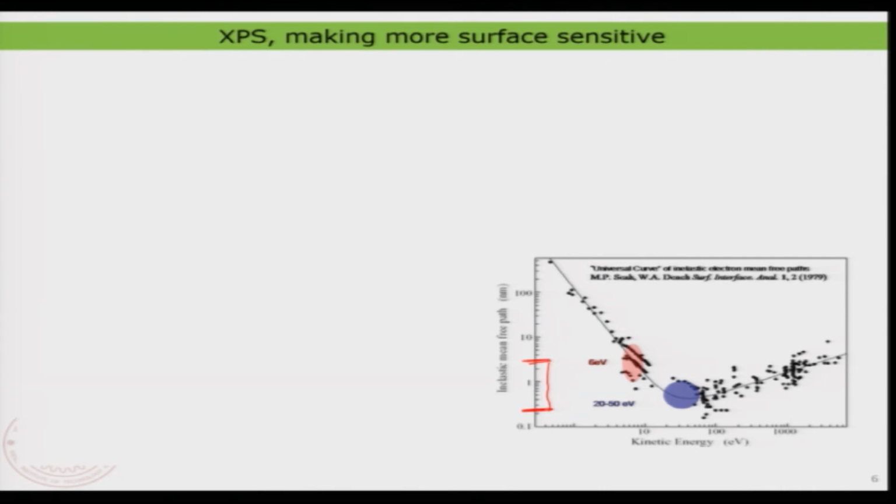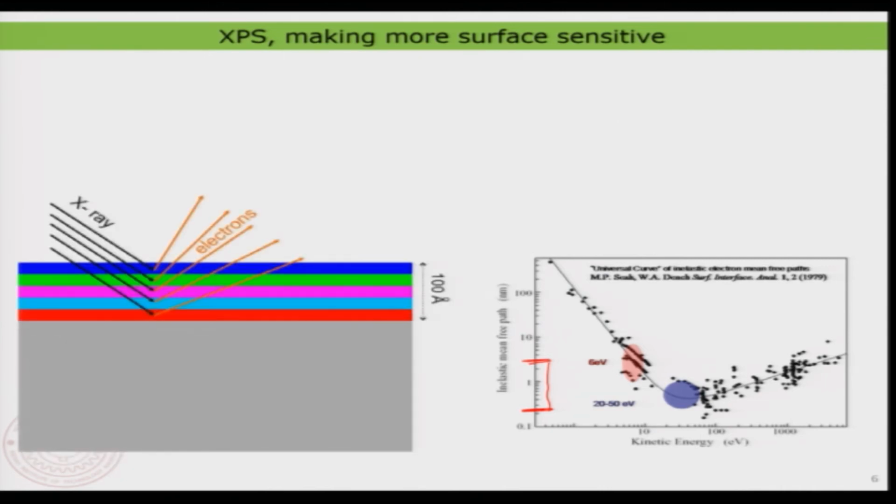But now imagine that you have a sample like this: within this 10 nanometers, I have 5 different types of material that are just sticking on top of each other. That means within this 10 nanometers I have made 5 different materials, each being 2 nanometers thick. Well, here we are having a trouble.